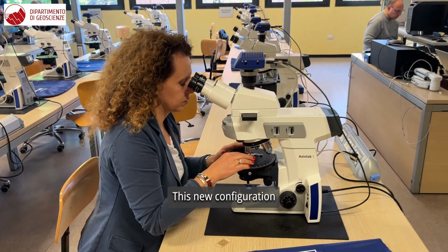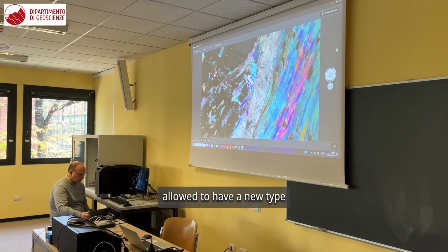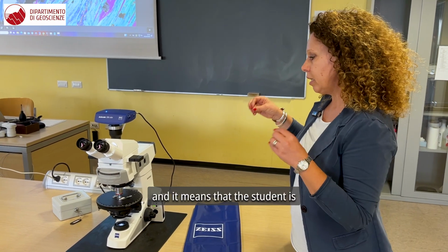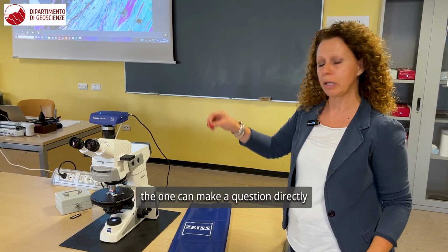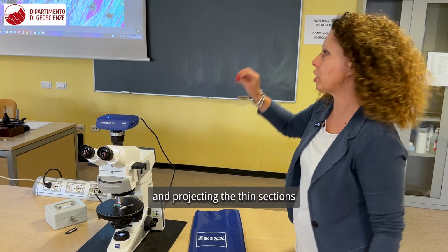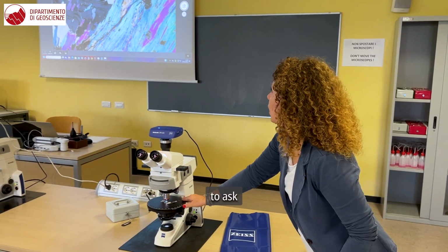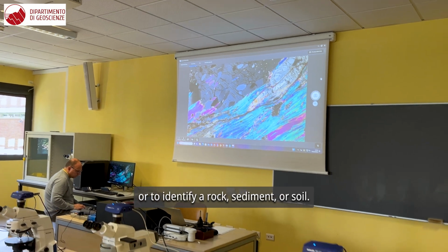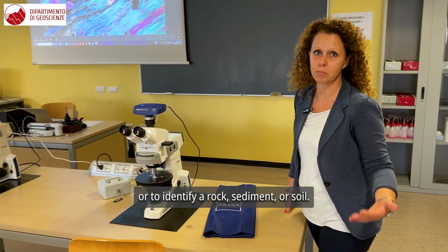This new configuration allows a new type of teaching activity, which is student-centered, and it means that the student is the one who can ask a question directly by looking at his thin section and projecting the thin section to ask specific questions on a mineral type, microstructure, or to identify a rock, sediment, or soil.